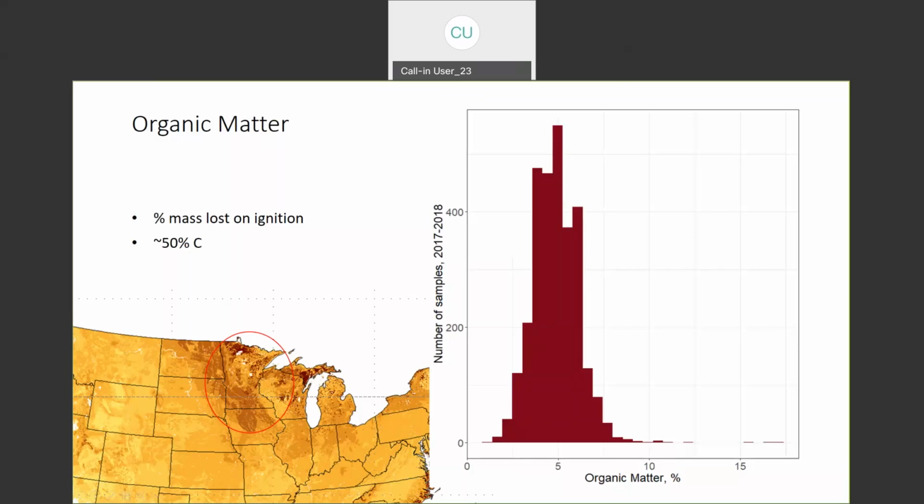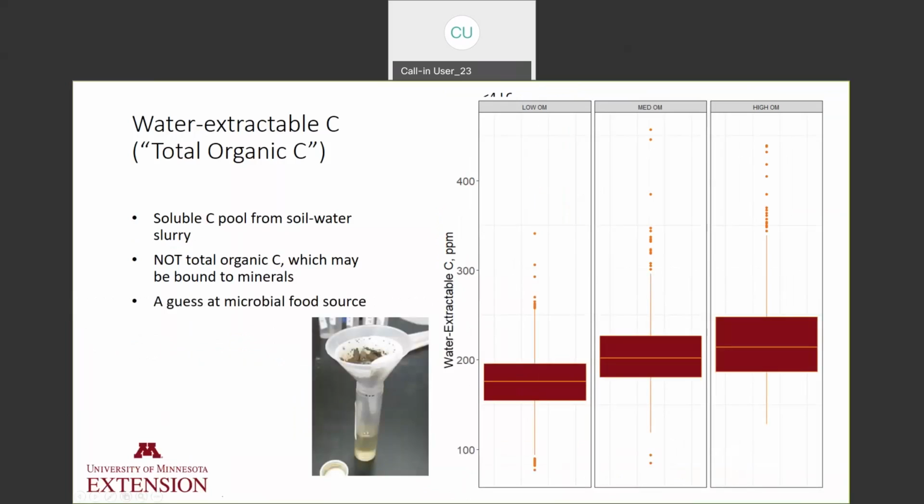So percent organic matter is tied to a lot of things, but especially with soil texture, another really important property. Texture data samples. But since we wouldn't expect a 2% organic matter soil to behave like a 6% organic matter soil, for the rest of the data, I'm going to divide it into three groups. There's going to be high organic matter data, above 5.5%, medium, and then low organic matter data. So all the rest of my plots are going to look like this.